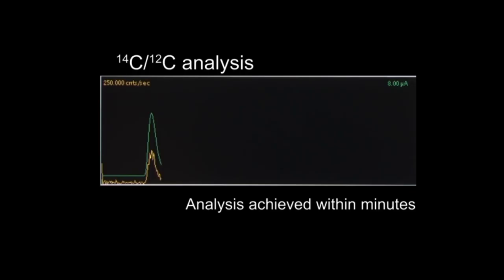And this is advantageous because, one, we can do it in real time. It only takes minutes to get this analysis, where before, when you have to do a solid graphite sample, it could take days. It also lowers the amount of chemicals that we need for our analysis. And it also improves our sensitivity by about 100-fold by doing it this way, because you're not losing anything in the graphite formation stage. So this has really helped increase our throughput, also increase our sensitivity, so we don't have to have large samples, and it's also reduced the cost it takes to get our analysis done.